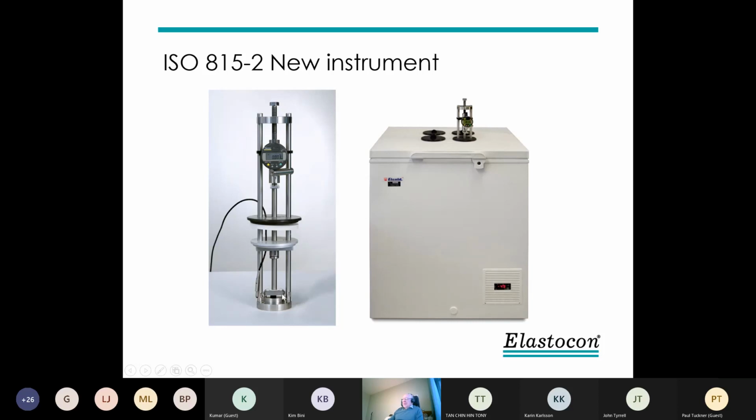We compress it first, and we can use spacers as in a normal compression set rig. And then when we have it 1 day or 3 days in the low temperature, we release it, say we turn this about 2 millimeters at two revolutions. And then we only have the upper compression platen and this bar resting on the test piece. And the weight of this is calculated so it will give the 23 kilopascal you have when you measure thickness on rubber. To make that possible, the rod here is made of titanium, as it would be too heavy if we used steel.